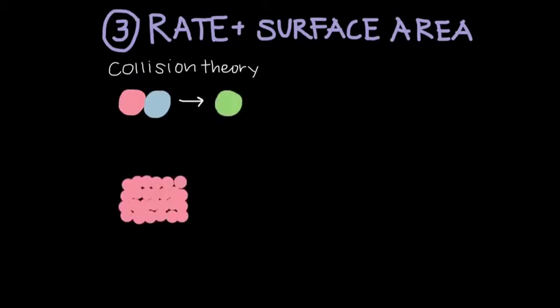When we observed the reaction, we used KMnO4 that was packed together tightly in crystals with small surface areas. This meant that the liquid glycerol molecules could only reach the KMnO4 that was on the outside of the crystal, and could not reach the molecules that were inside the crystal.